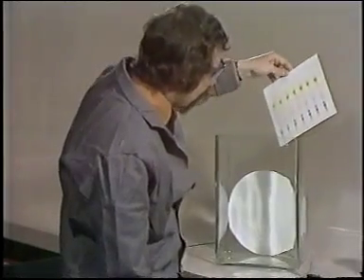The solvent in the tank rises up past these spots on the plate. We can see this more clearly using time-lapse photography. Polar compounds in the mixture are held most strongly on the surface of the silica gel. So it's the least polar compounds that travel furthest up the plate. We might even need to change the solvent to get the most polar compounds to move. A TLC plate takes about half an hour to develop.